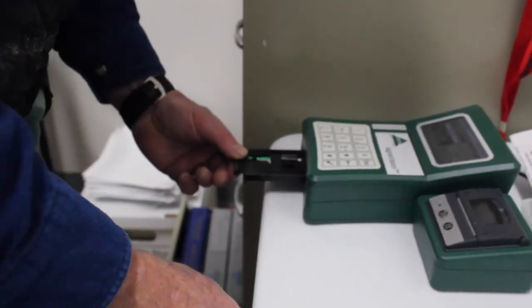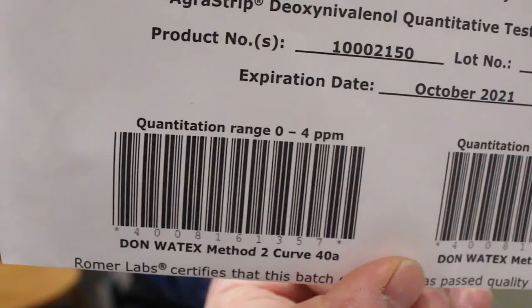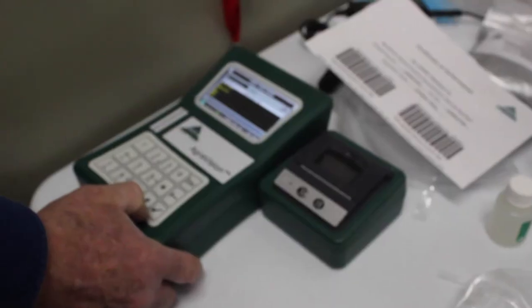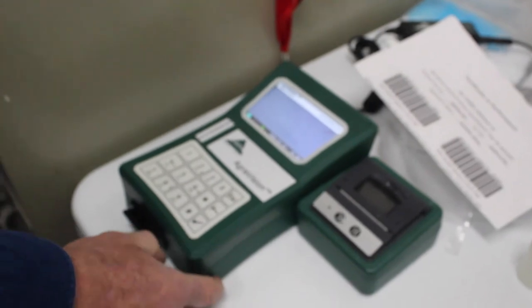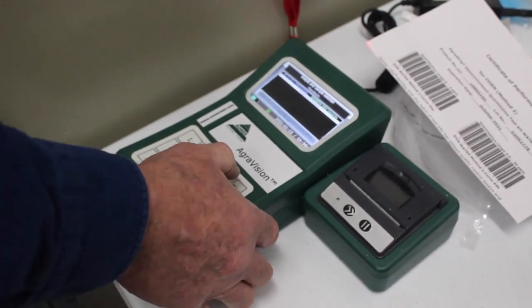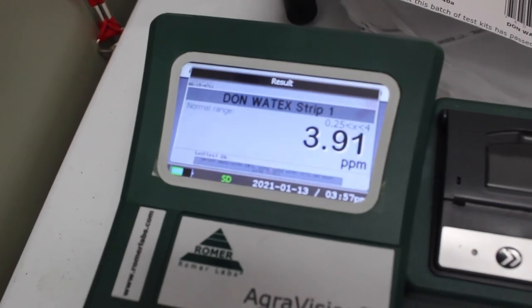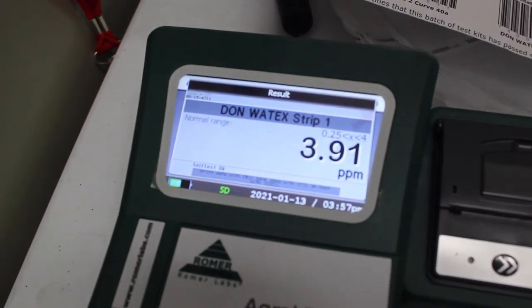After three minutes the test strip is removed and verified that the test was run properly. The test strip is placed in the reader, the test barcode is inputted, and the correct test is selected. The reader analyzes the sample and gives us vomitoxin parts per million results. In this test, our results came up 3.91 parts per million.